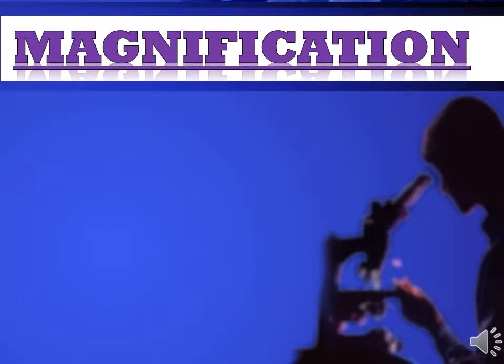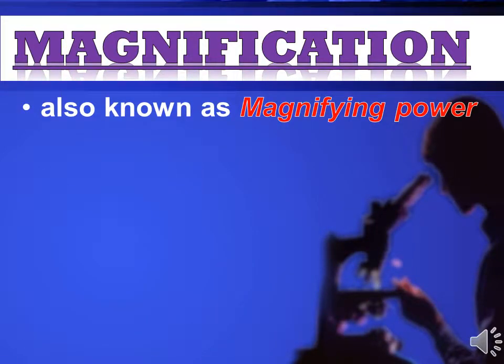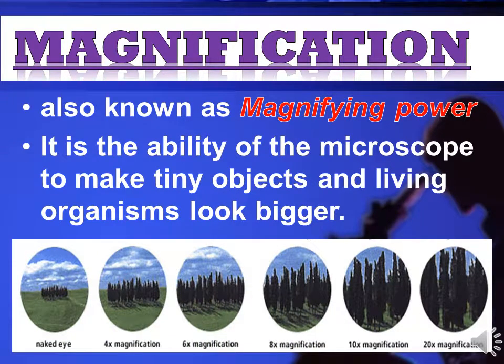In discussing microscope, we must define what is magnification. Magnification is also known as magnifying power, wherein it is the ability of the microscope to make tiny objects and living organisms look bigger. The picture below explains what we can see under different magnification.